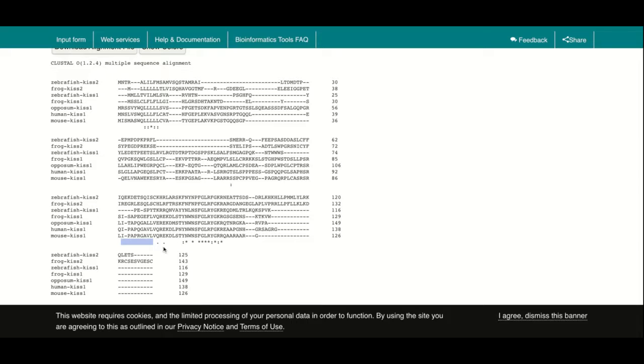So now let's see the one dot. We can look over here on this column, and then on this other column. Your job is to figure out which one is the most to the least conserved. Your choices are the star, the two dots, the one dot, or no dots. So there is a grading here of how conserved the amino acids are in each position.